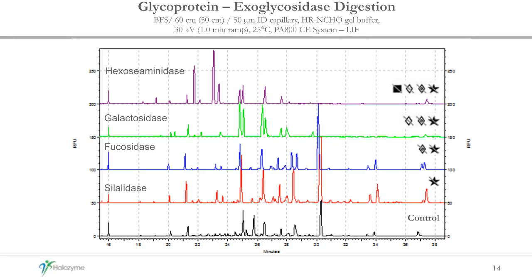Now we wanted to confirm that the IDs we're getting with the database that SCIEX has provided are the same identifications, and that for the additional peaks we're seeing, we can enhance them, measure them and get an ID, just to make sure we're capturing all the glycans for our product.